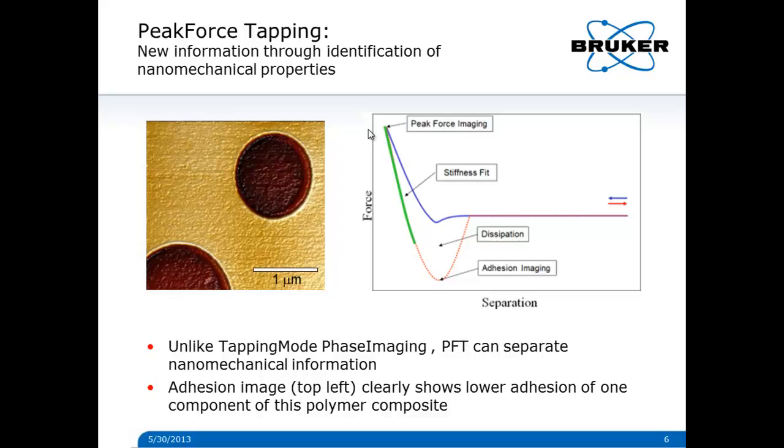The whole curve is available for analysis since it is not filtered by the cantilever transfer function. With some minimal processing, the deflection data in the previous slide can be converted to a force curve, as we see here on the right. Basically, during the approach we have no force, and then it comes into contact, and then it's on the surface, and then retracting it comes back down, and we have the adhesion point, and then it breaks free of the surface, and we're back to zero force.